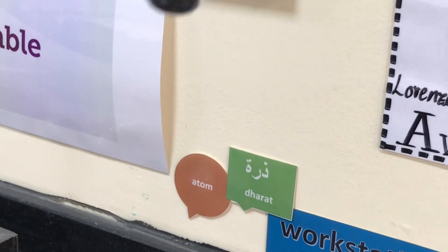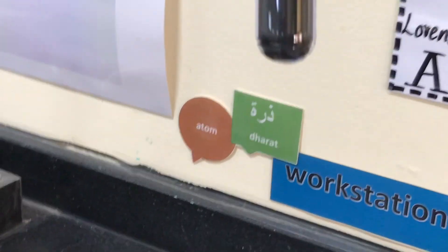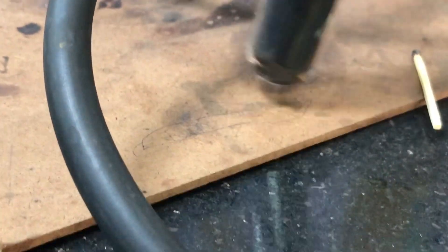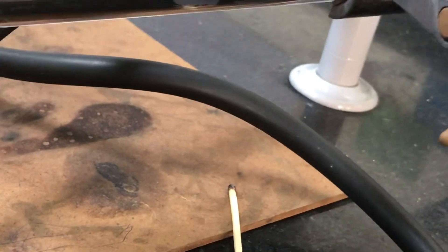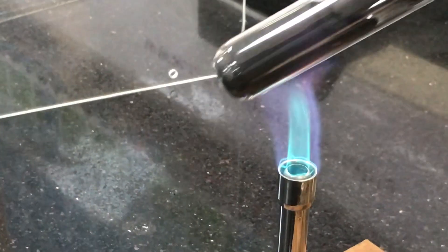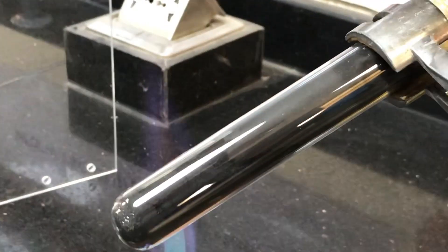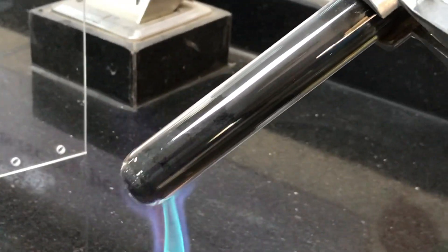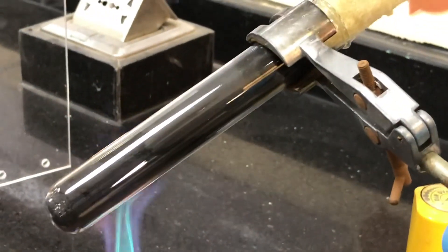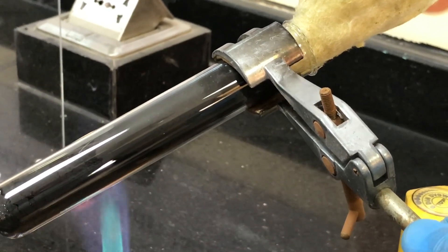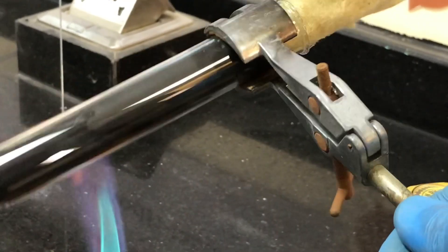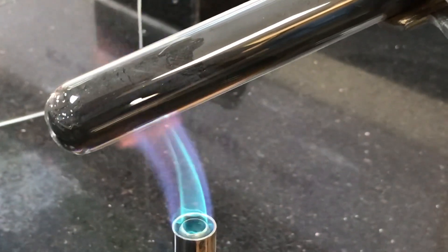I'm just gonna shake it around just a little bit, you can see that the powder is there and if you're looking you'll actually see it dancing around. Just give it a gentle tap just to bring any powder up the bottom and then repeat. Now once it starts going it's actually going to be really rapid so you just have to be well aware of this. It will start to go very slowly and then suddenly it will start to glow.